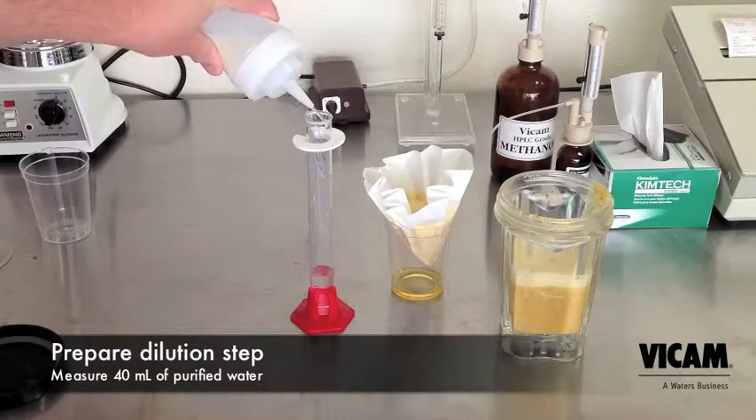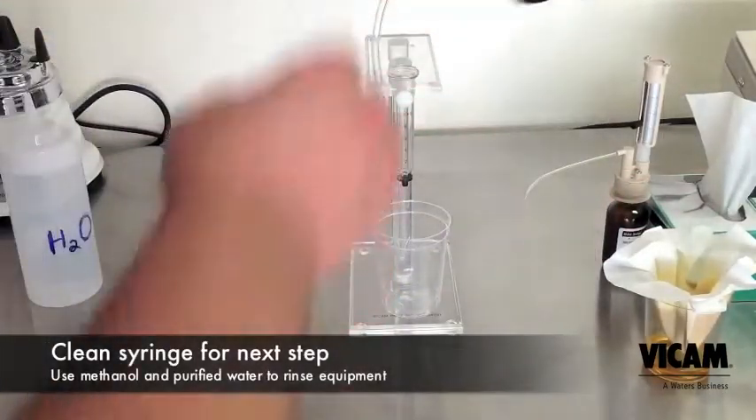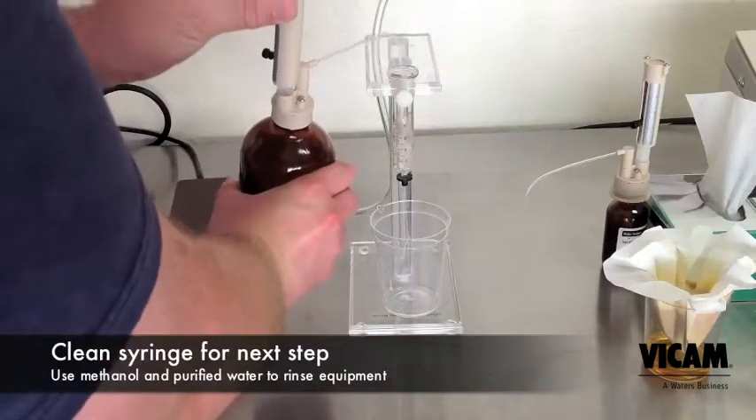Measure 40 milliliters of purified water. If you haven't already, now is a perfect time to clean your collection syringe. Use pure methanol and purified water to clean out any residue left from the last test.